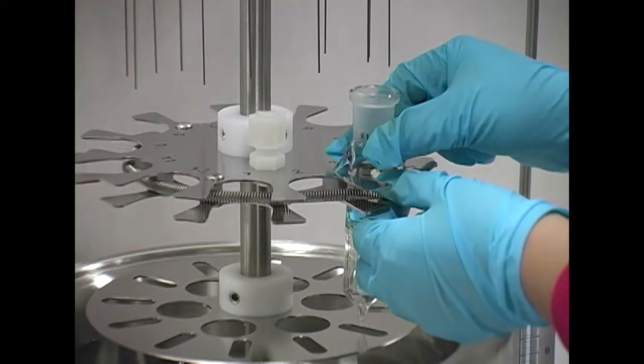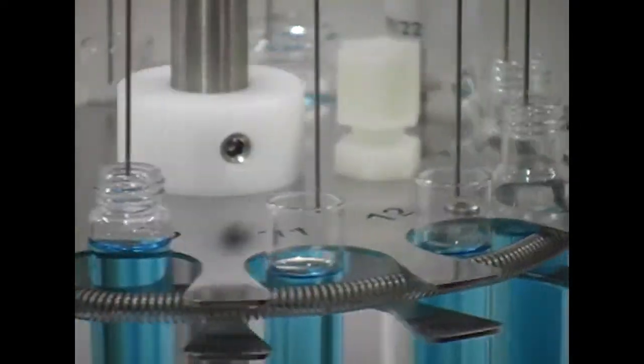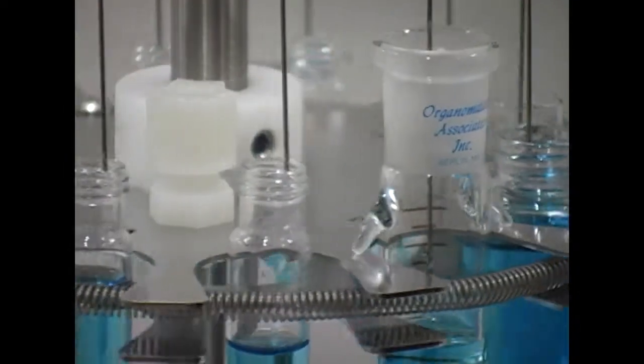For endpoint operations, place the concentrated tube directly into an evap nitrogen evaporator. Reduce the final volume to the endpoint desired.